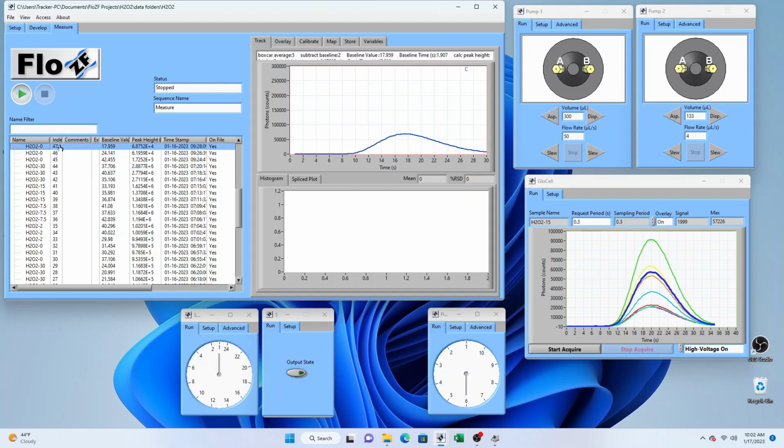and when you display them, if you want to change the x-axis, the y-axis, just type it into the top number and it will change that scaling.